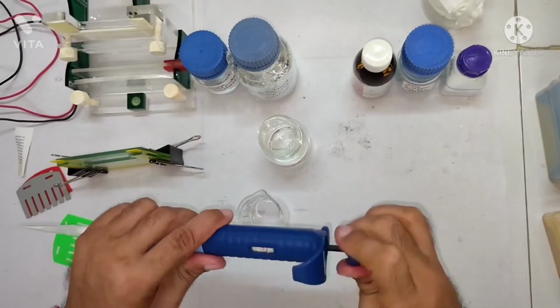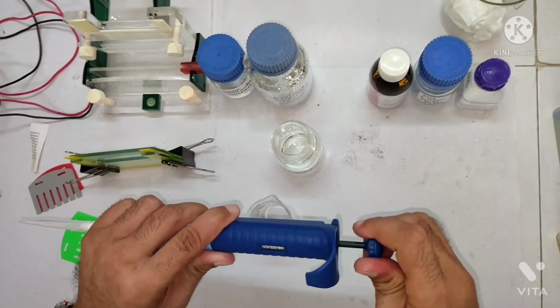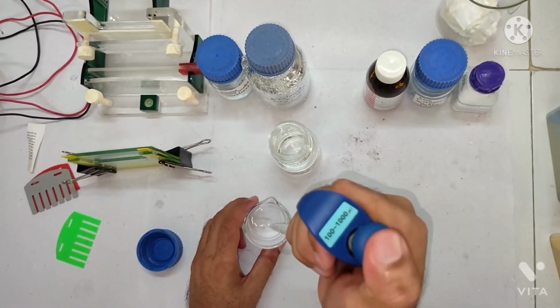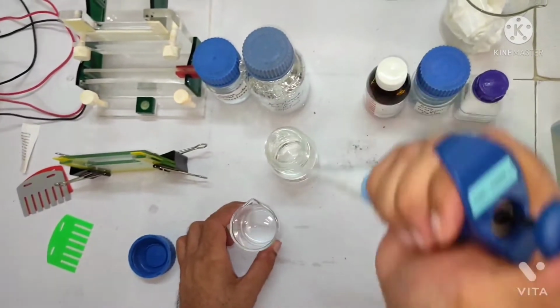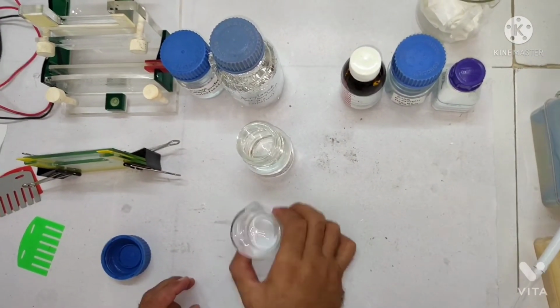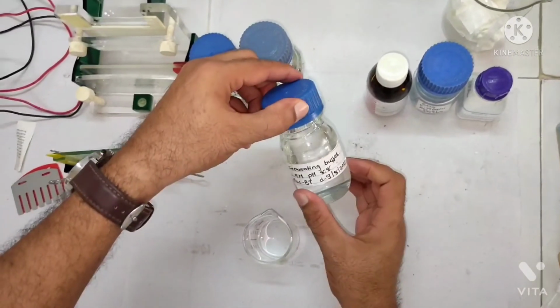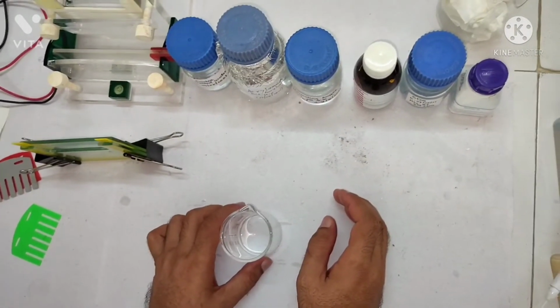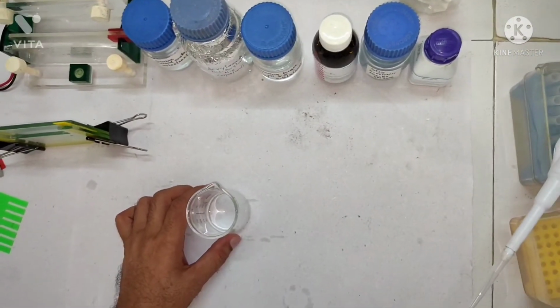So this is 0.5 and now we put 2 more ml. This is the cocktail for the 10 ml, right? Mix it. Always keep on mixing. Okay, so now this is 2.5 ml. So separating buffer 2.5 ml, 1.5 molar pH 8.8 has to be added. Okay, so now another chemical which is called TEMED. So 5 microliter TEMED should be added.